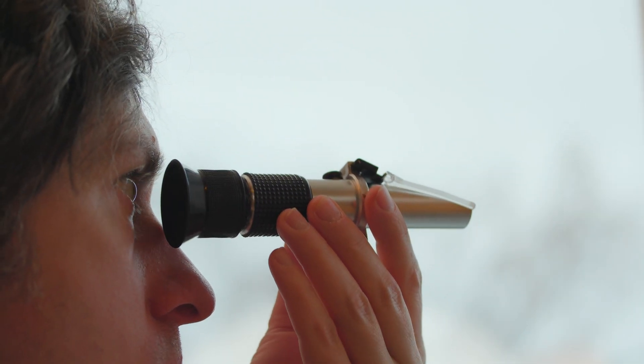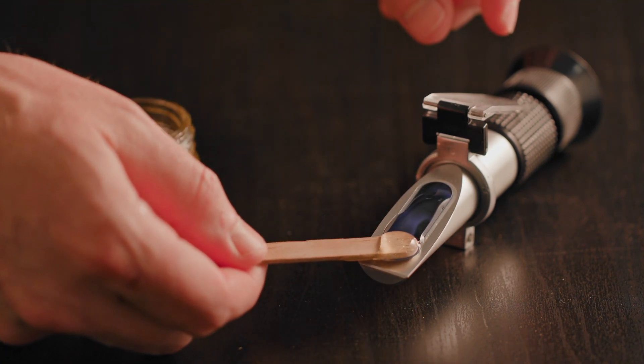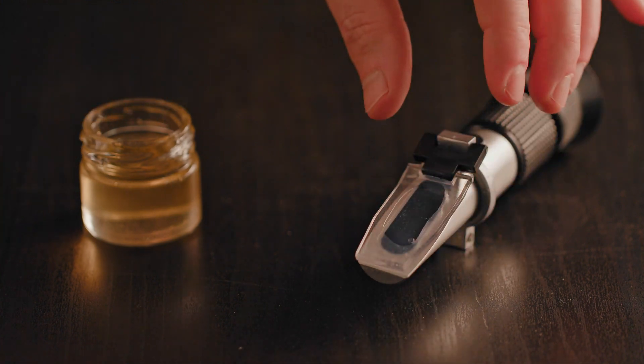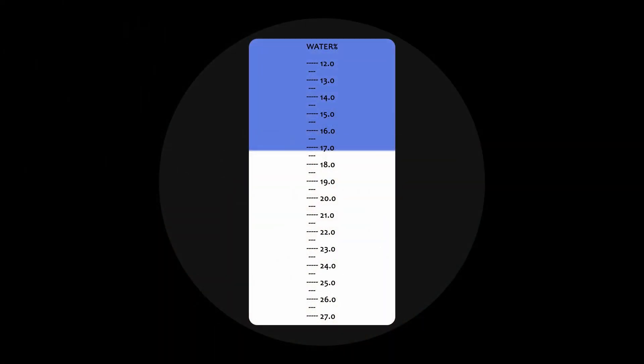When looking through the refractometer before placing honey on the prism, you can see a scale in percentage — generally from 12 to 27% on a honey refractometer. Some refractometers will have two or three scales, the Brix scale being quite common. To take a measurement, put a thin layer of honey covering all the prism surface. Stand in front of a good light source and adjust the focus ring if necessary. The reading is done at the junction of the blue part and the white part — here we have a reading of 17.2%, which is an excellent value.